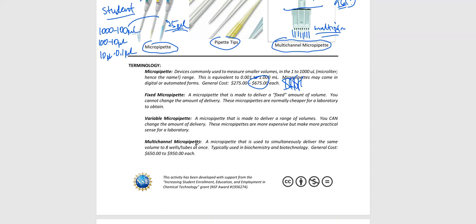Your lab, when you get a job, will have a preference, and that lab will typically stick to that preference unless there's some kind of mass overhaul that begins to happen because the company has decided how to save tons of money by changing out a micropipette supplier.